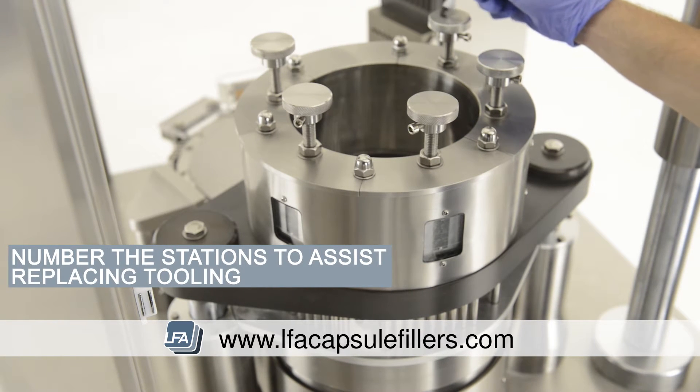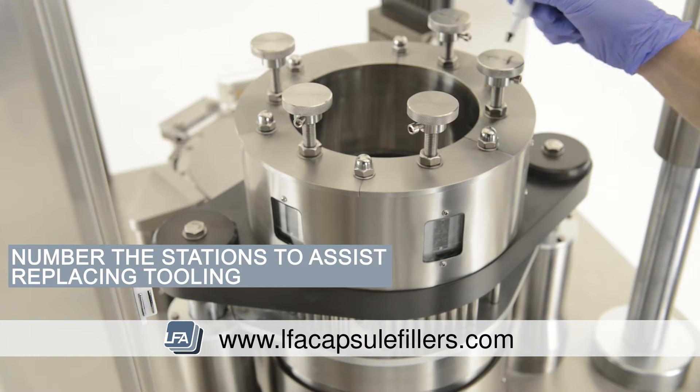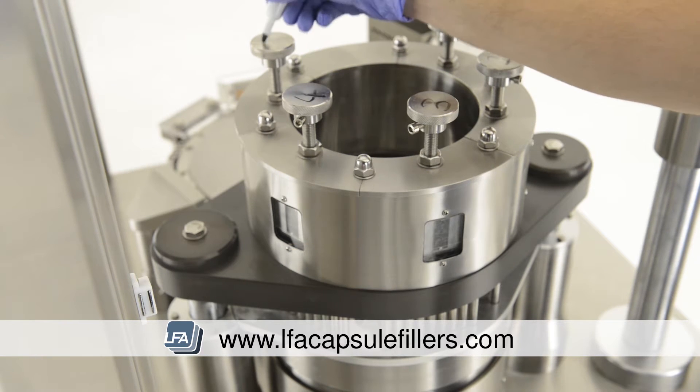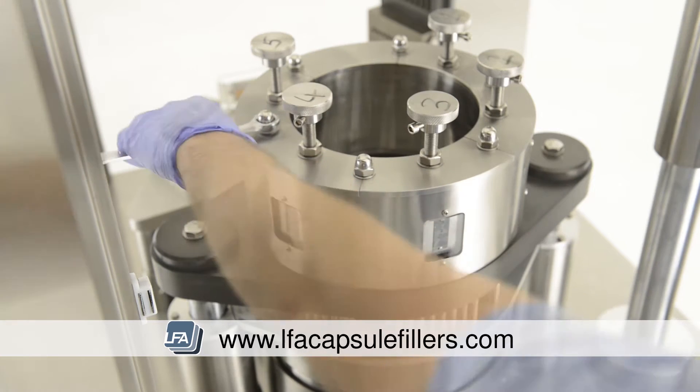The next important step is to number the stations. This is to assist us when we're replacing our tooling. Take your spanner and remove the nuts and washers around the top section of the tamping turret.